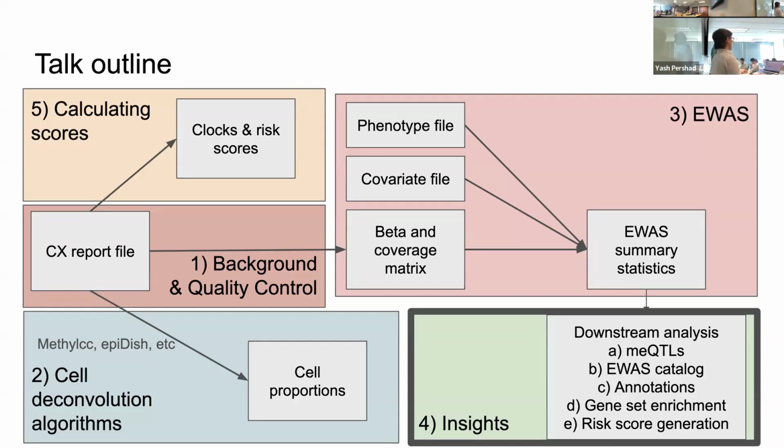It's the most flexible to have complete data, and it's been shown repeatedly that we do a pretty good job if we have a big enough sample size. So I usually do not do that when I model. I use that for clocks, but when modeling, the first line will just be filtering for missingness. But again, it depends what you want and what the data look like.